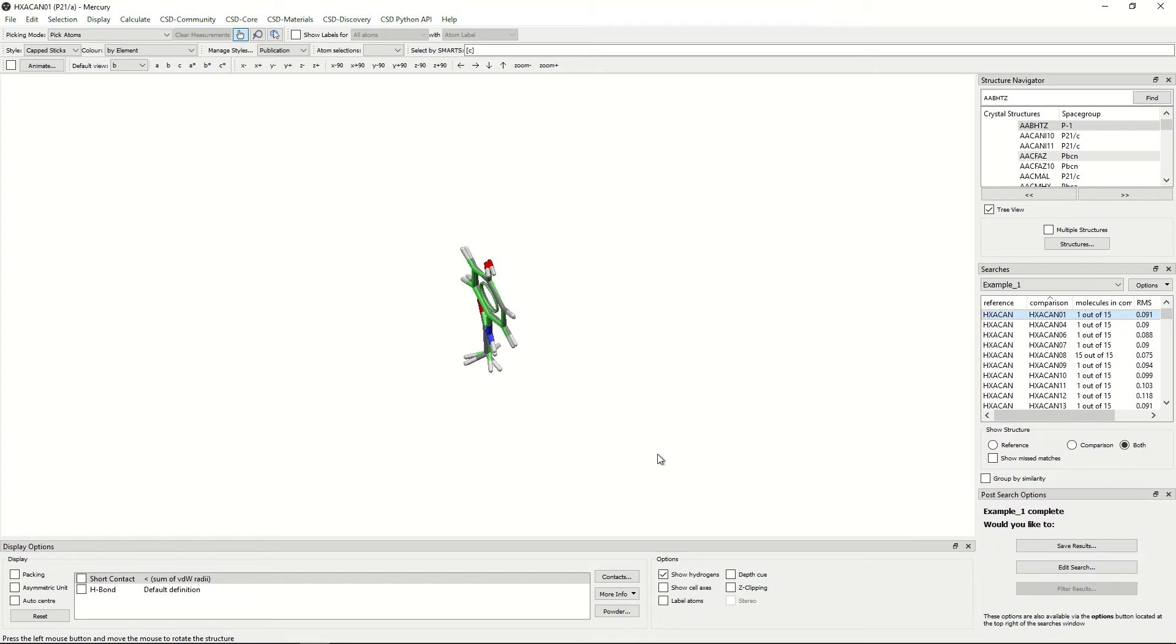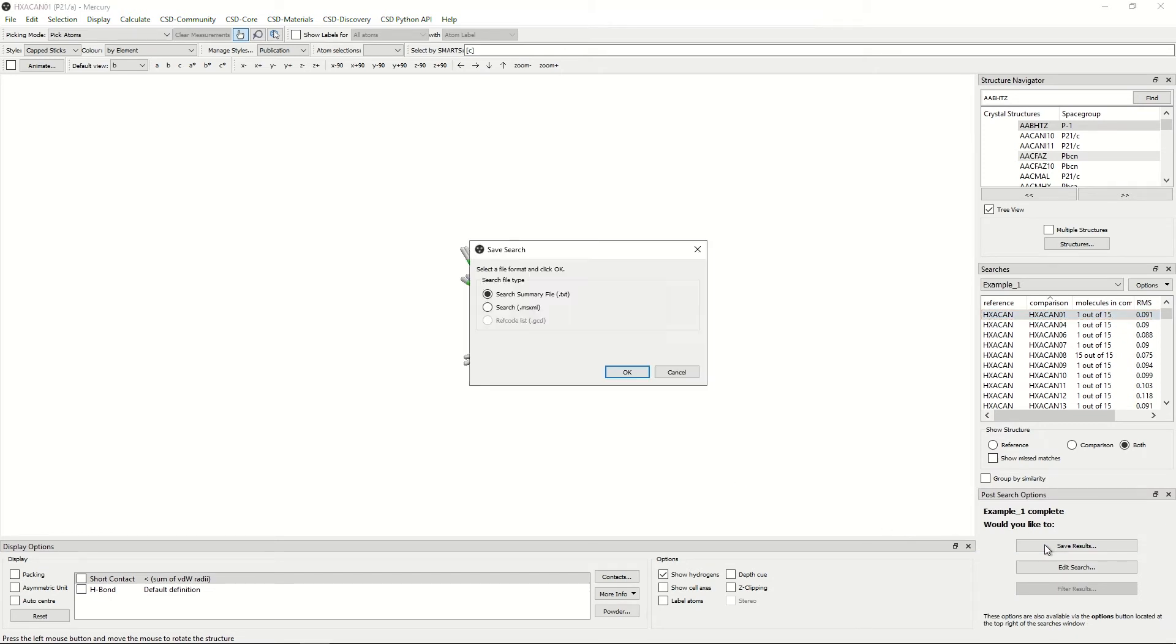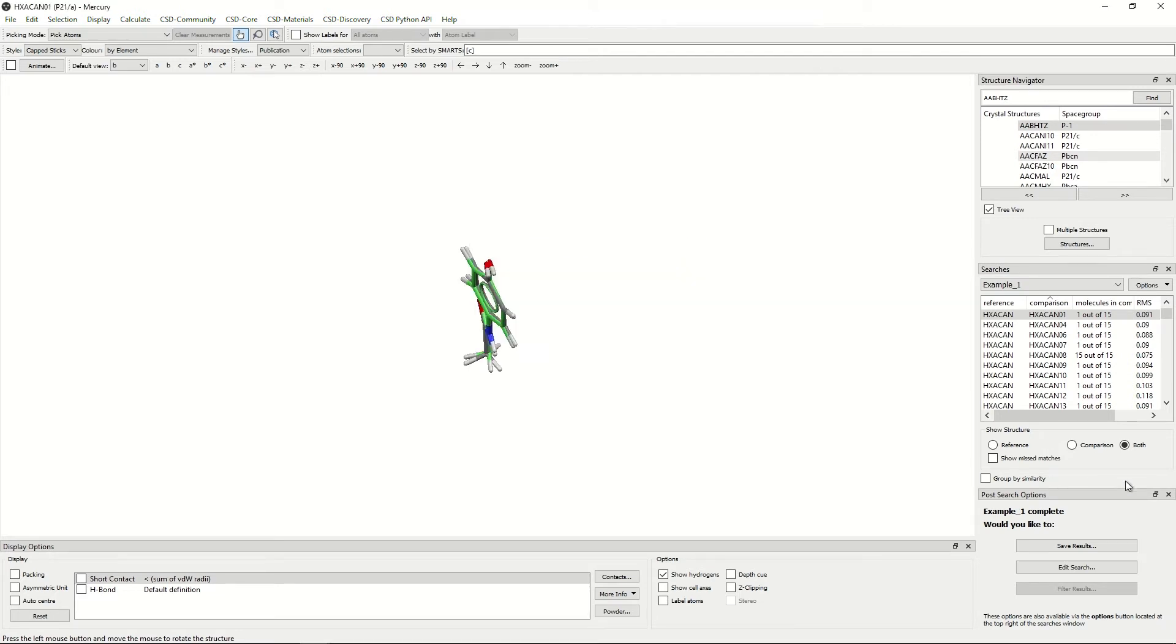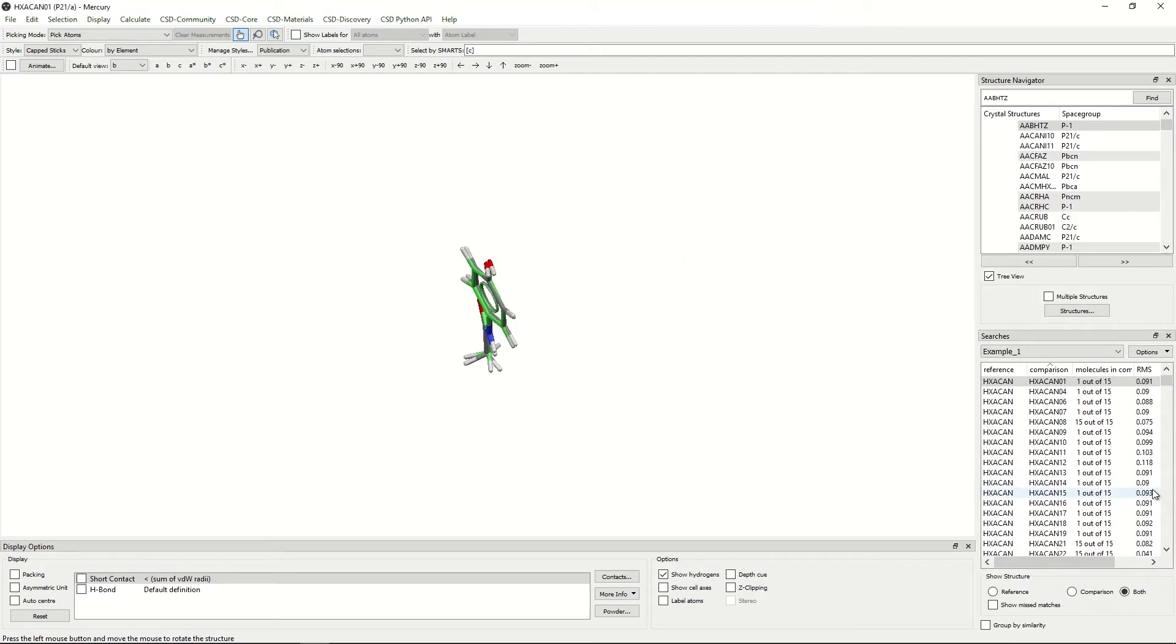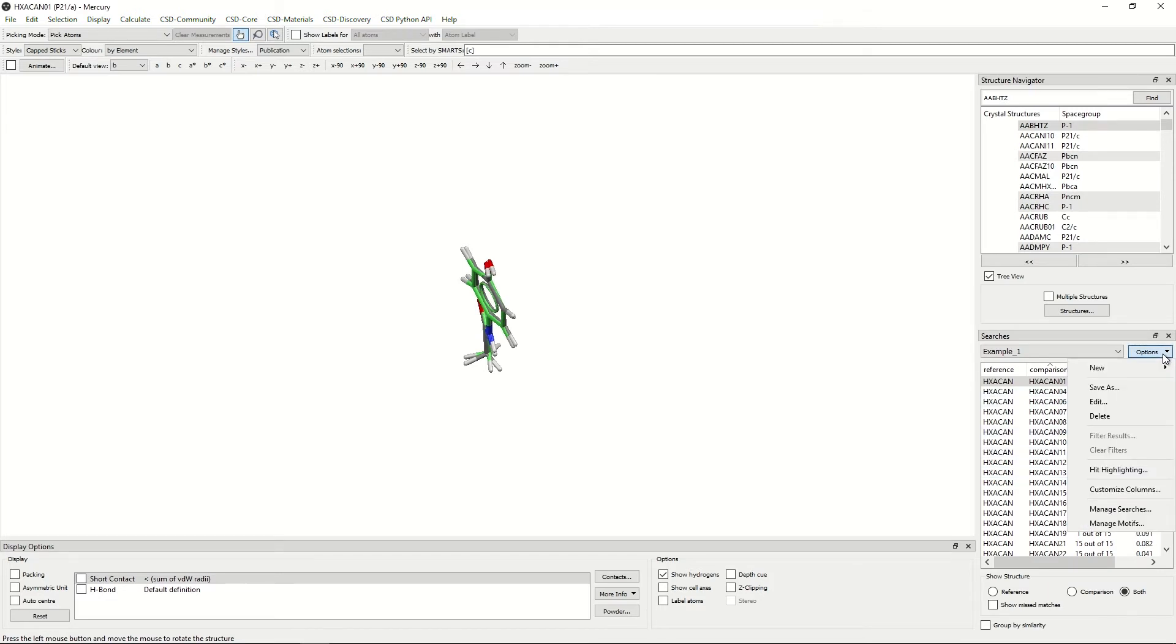Once the search is complete, you can save your results here by clicking save results and save them with a search summary file or the search file. You can also save your results by using the drop down window under options on the right hand side of the screen here and clicking save as to bring you to the same window.